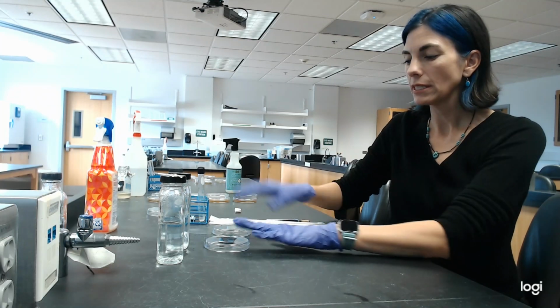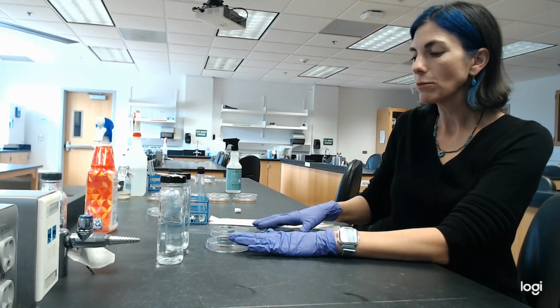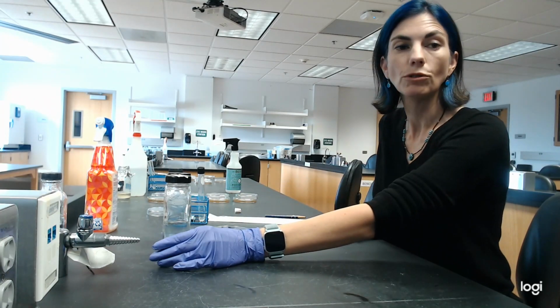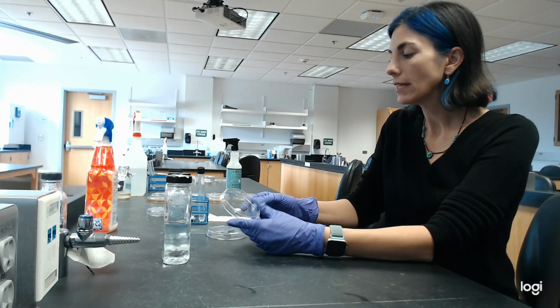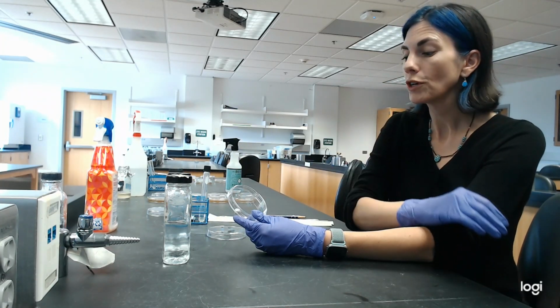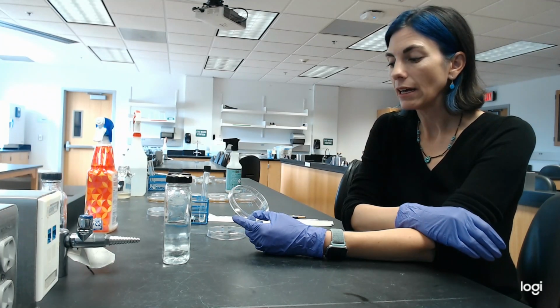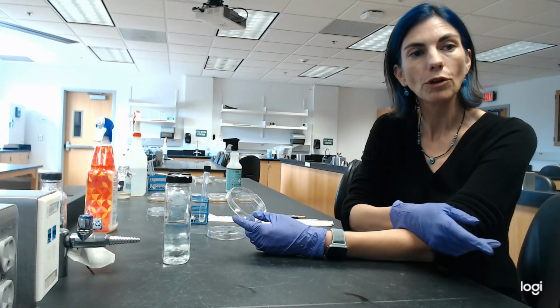And you might notice that I don't have 4 plates set up here. I only have 3 of these plates. That's because I'm not going to do all of the dilutions that we did for the first set. Because I've got E. coli in nutrient broth, I am anticipating that a 10 to the minus 4 plate would still be too numerous to count.